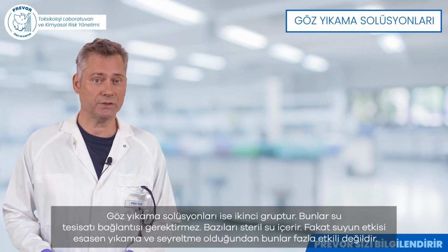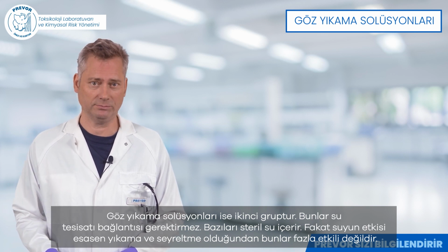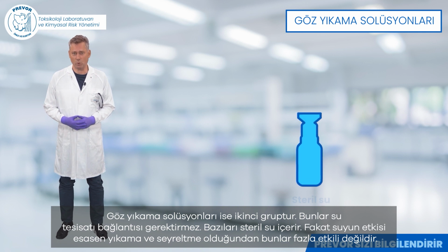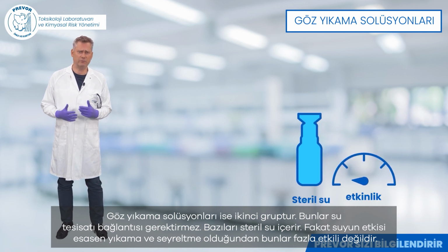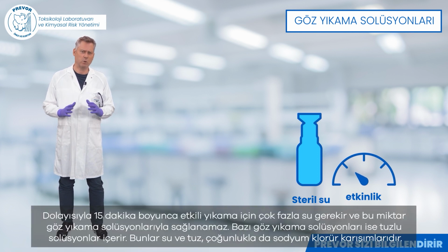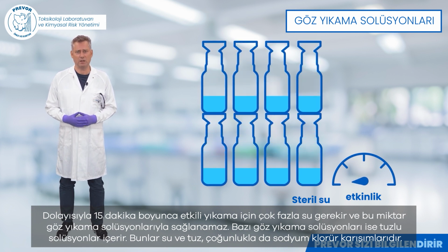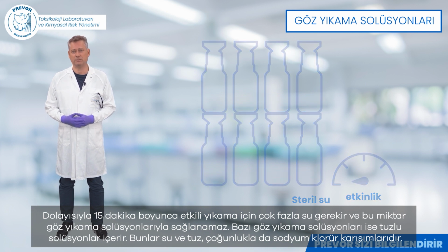Eye wash solutions form the second family. They do not require a water connection. There are some with sterilized water. These are, however, of limited interest, since the effects of water are mainly the effects of rinsing and dilution. The quantity of water required for an imposed rinsing of a duration of 15 minutes must therefore be large, which is not the case with these eye washes.